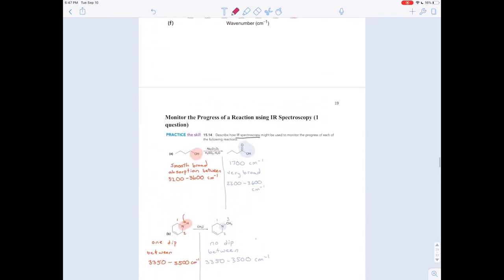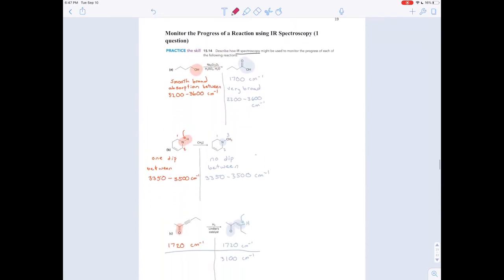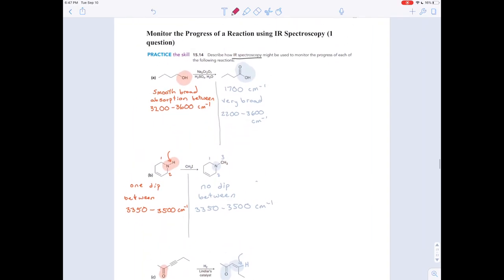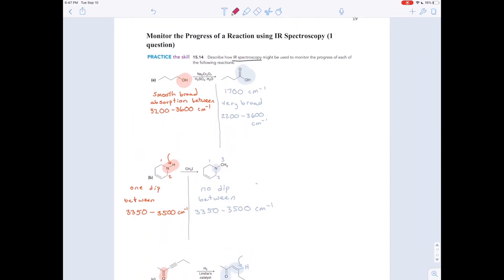So, that's how you can monitor the progress of a reaction using IR spectroscopy. Thank you.